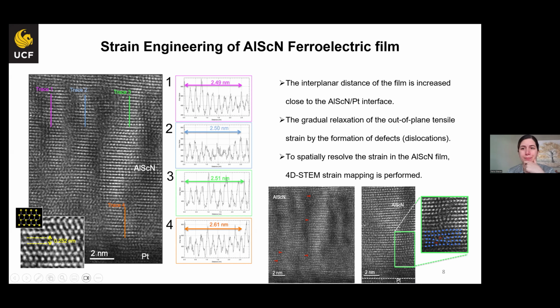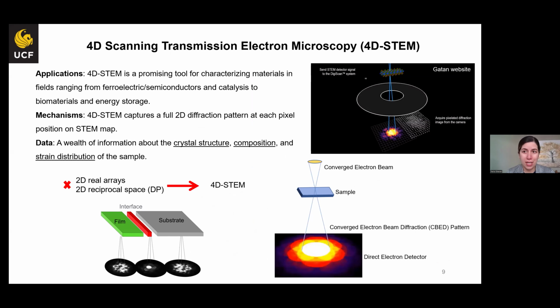In this new ferroelectric material, which is called AlScN, whenever we have scandium doped into aluminum nitride thin films, we have ferroelectric properties. And as you can see here, in a simple way, we can measure the d-spacing from left to right, top to down. What we can see is that the d-spacing of the film doesn't change when we move from left to right. However, we have a big change when we move to the bottom part of the film because of the lattice mismatch that we have in the system. And as a result, we can see more dislocations and defects whenever we get closer to the interface.